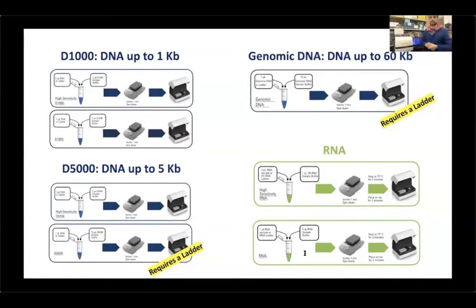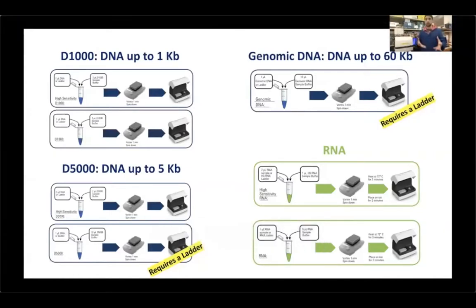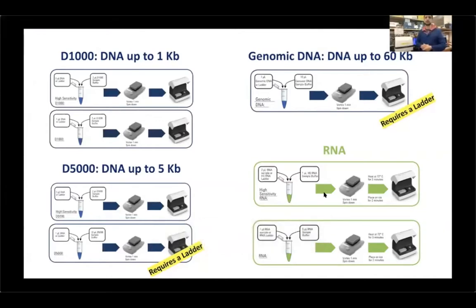The only difference between DNA and RNA is that RNA, as you know, is a single-stranded molecule and forms secondary structures. The presence of secondary structure might interfere with the electrophoresis, so normally you do electrophoresis in denaturing conditions. You use chemicals poured into the gel, or you denature the RNA right before electrophoresis, but then you still need some denaturing agent during the run, because it takes quite a while to separate RNA. We're usually talking about 30 to 60 minutes.